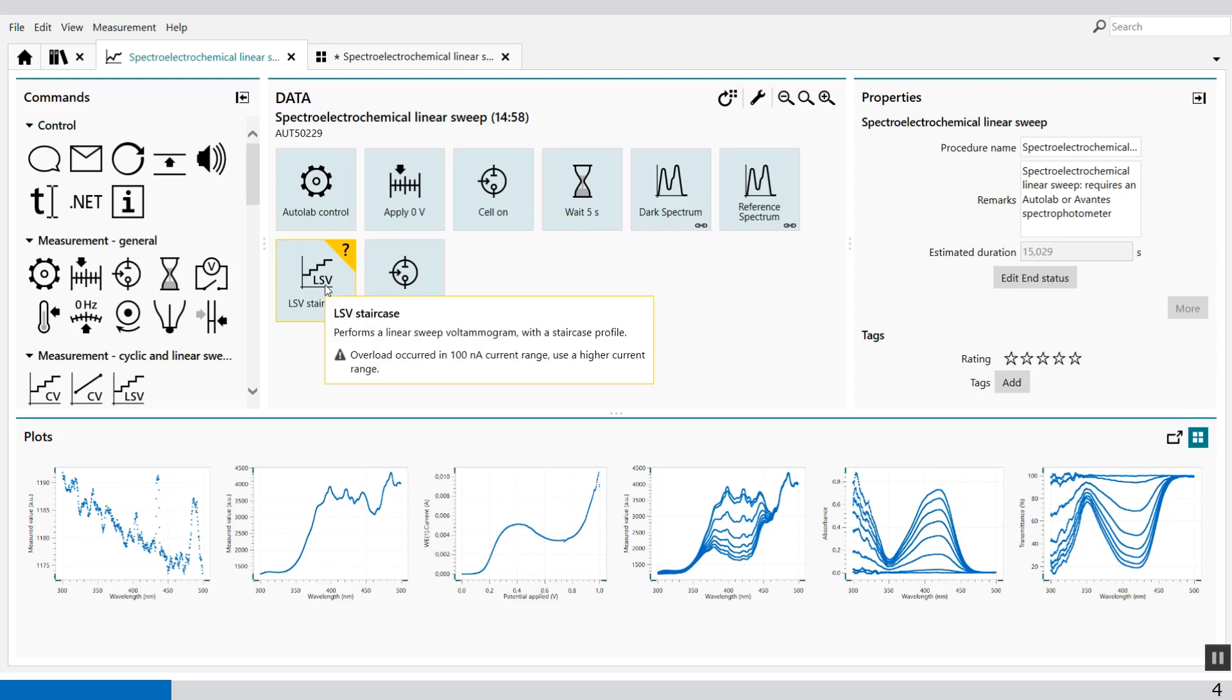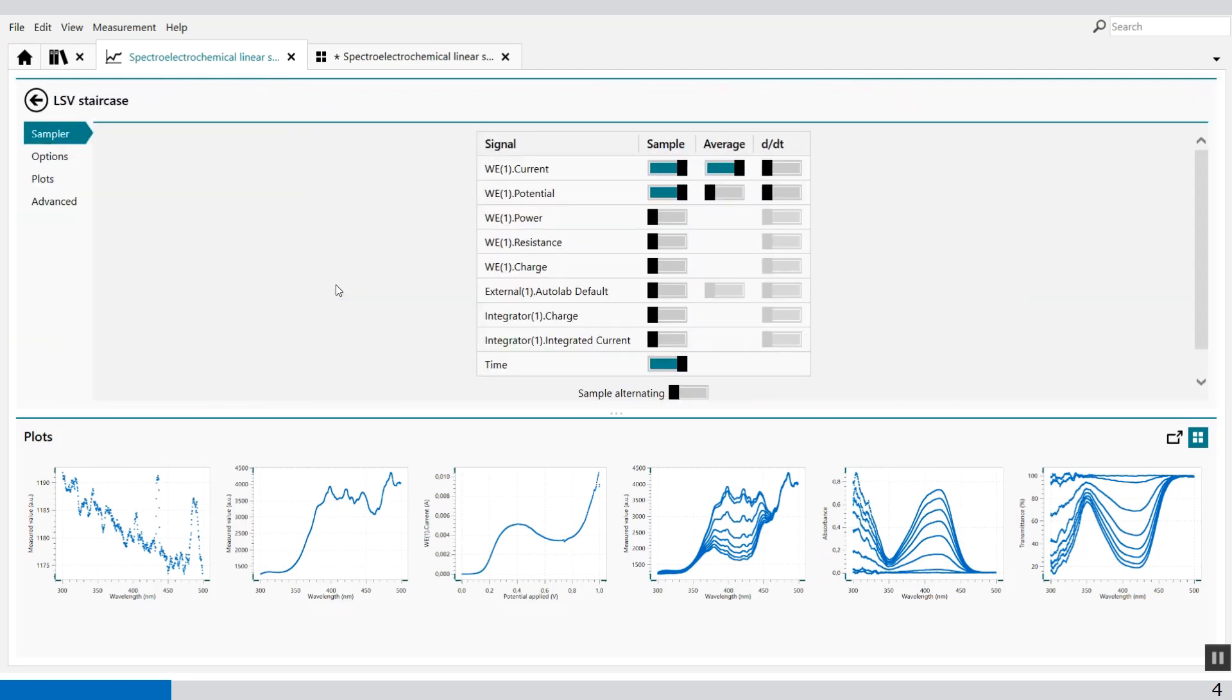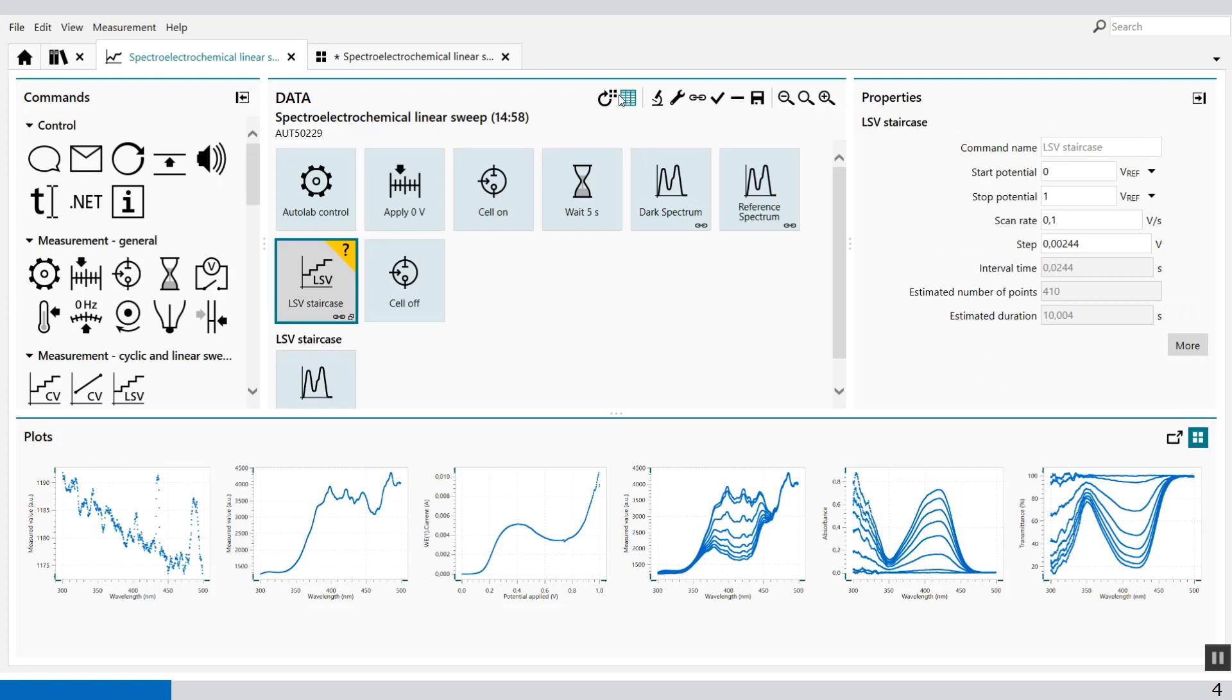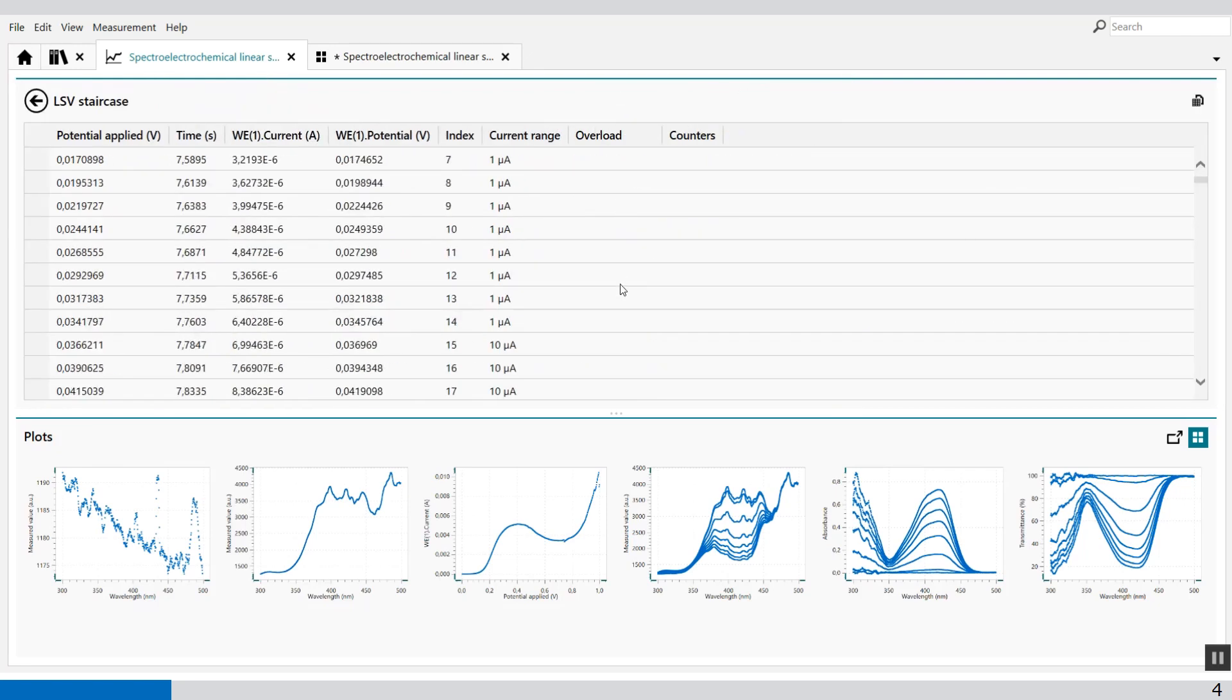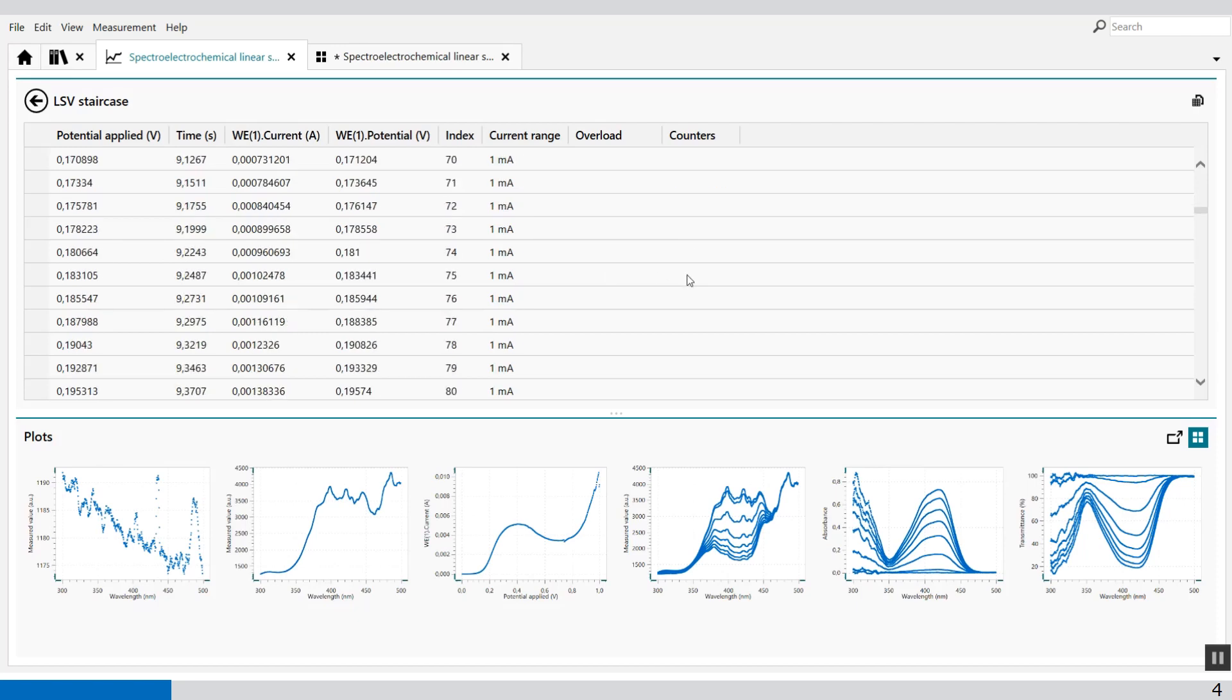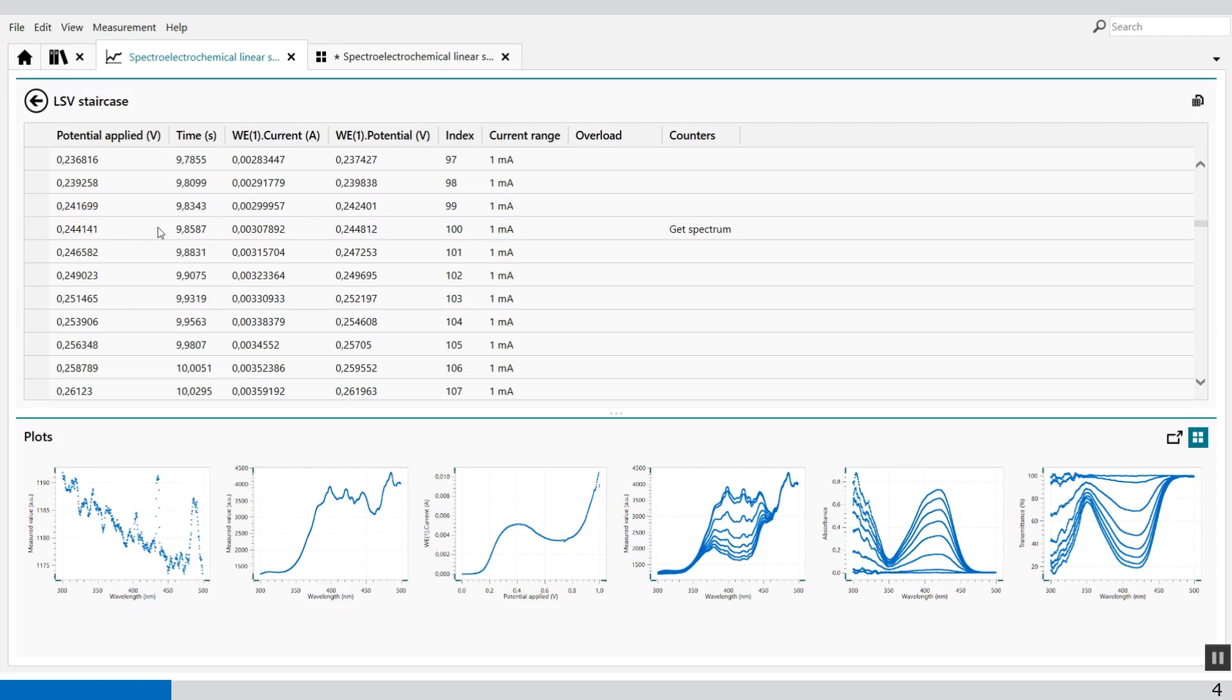After the measurement, you can also visualize where the data is taken. So you'll see all the raw data. But you can also see at which voltage potential the spectrum is taken. So get spectrum 50 data points at this voltage. And again, we can see that at 100 data points, this voltage, this spectrum.